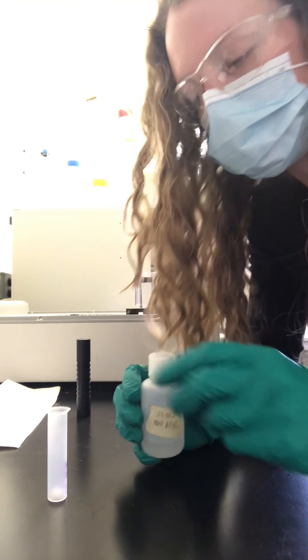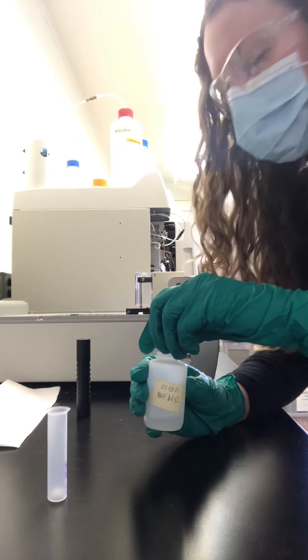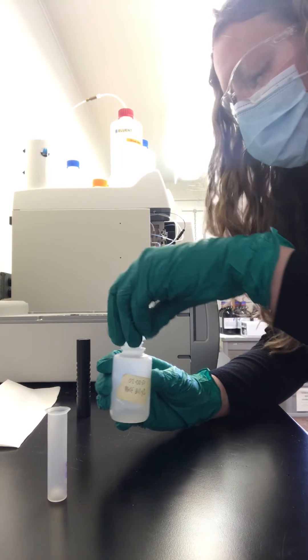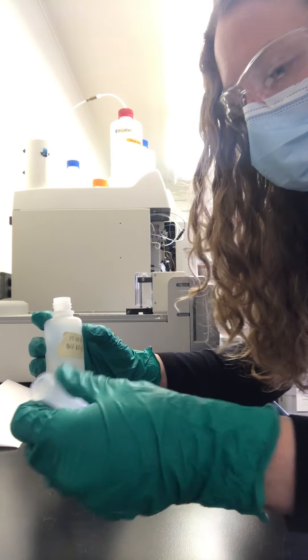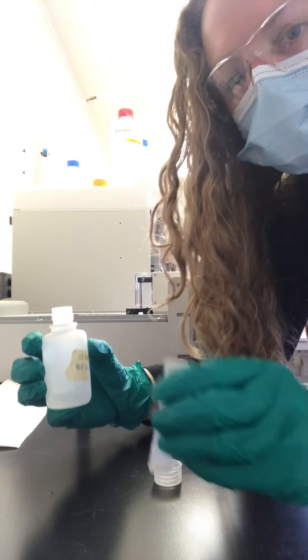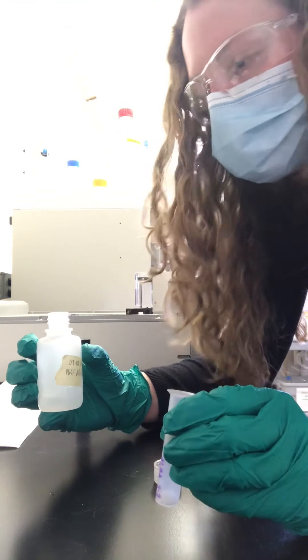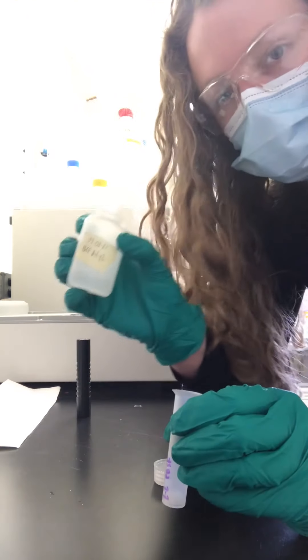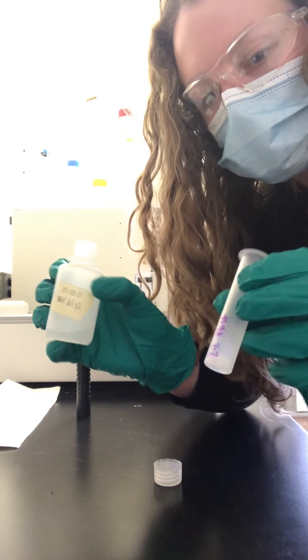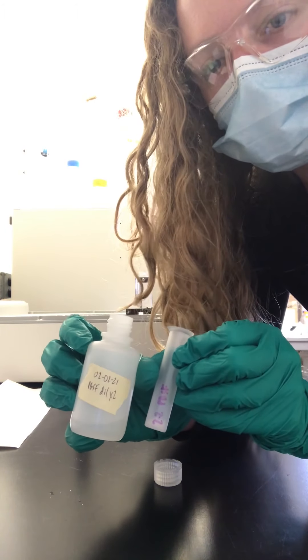Here's how I prepare the sample for running on the ion chromatograph. I have a labeled vial, and every time I'm pouring samples from my bottle into the vial, I check to make sure that the label matches.